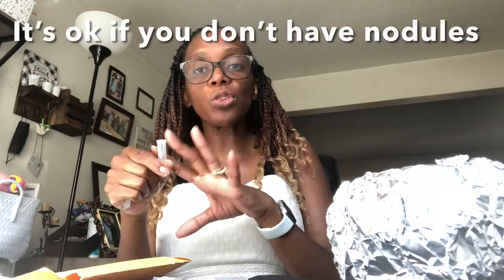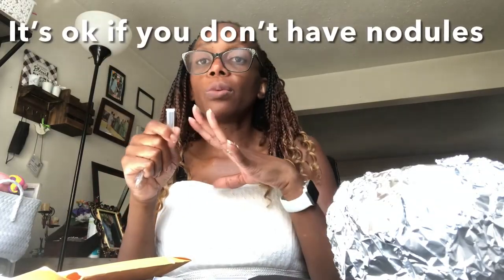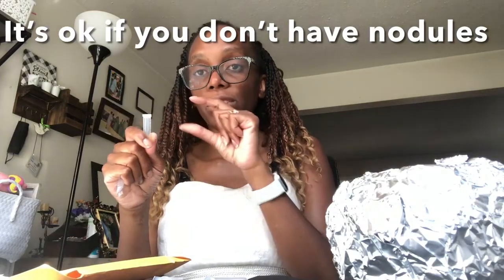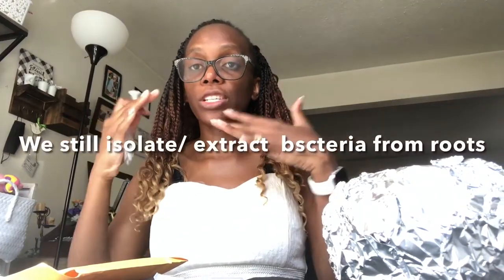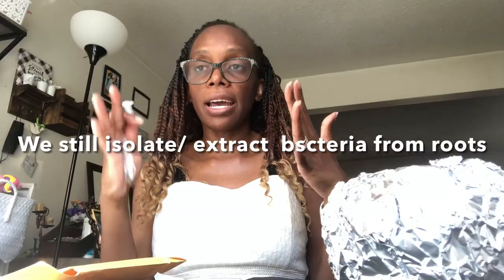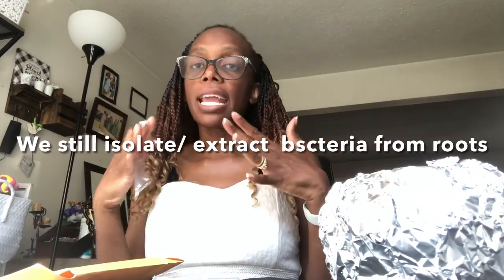Okay, so whether you have root nodules or not, we will still do this. If you have no root nodules, then just cut off a segment of the root, because remember that in the signal exchange, when nitrogen fixing bacteria and legumes actually interact, first they communicate.